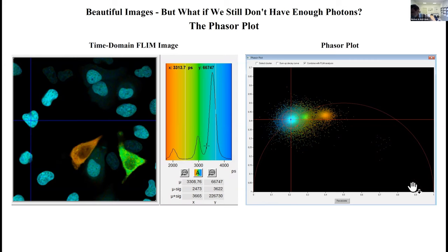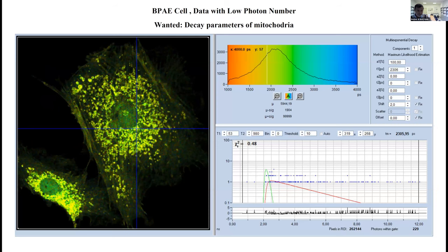What you get then is for every decay function you get a pointer. The pointer has a phase angle and it has a magnitude which is the distance. If you have different objects of different decay signature, then you see that these objects form different clusters in the phasor plot.